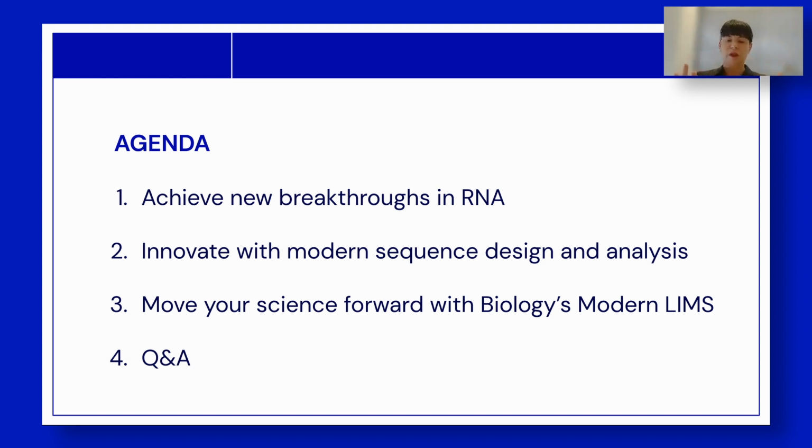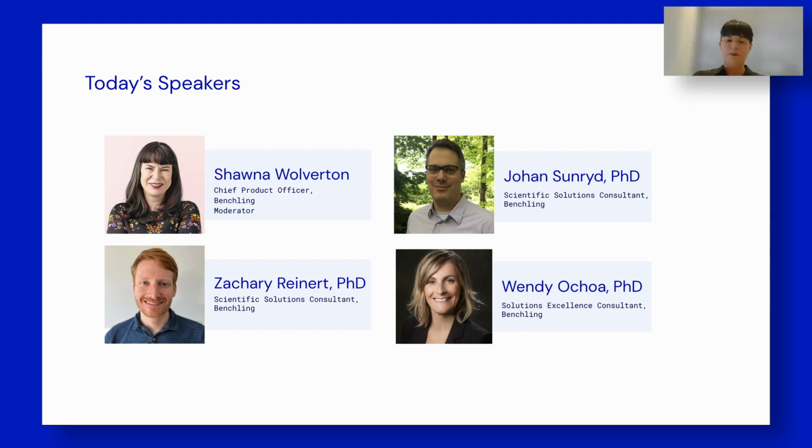We're going to close with some Q&A, so please go ahead and ask your questions in the box, and we will get to as many of those as we can. We have an amazingly great lineup of speakers here today, experts in our products, solutions, and our customer experiences. So we're going to dive in to our first webinar topic, and that is achieving breakthroughs in RNA.